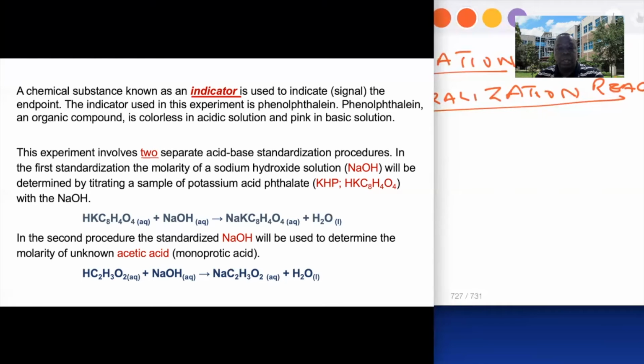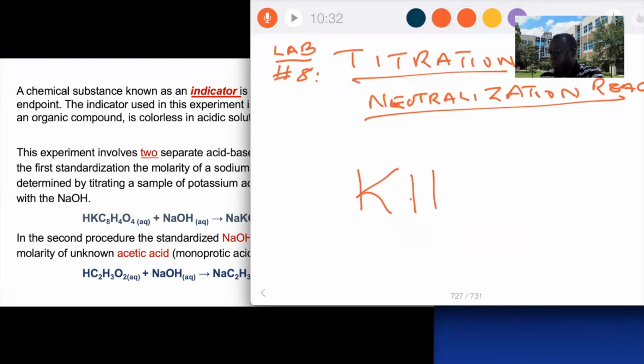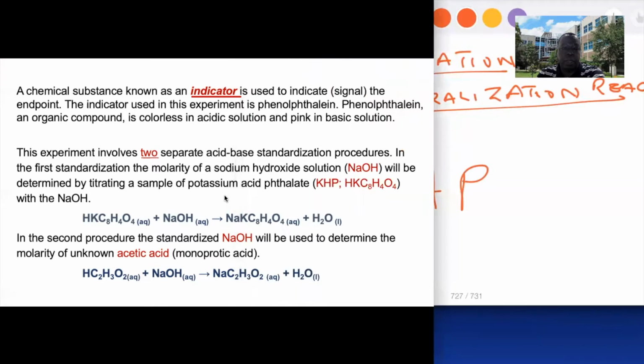This is the balanced equation you need for section 4.3. Take note of the chemical formula for KHP. Quite often students use this. When we say KHP, you may think that this is what you will use in determining the molar mass. No, you have to use the entire chemical formula in finding the molar mass.